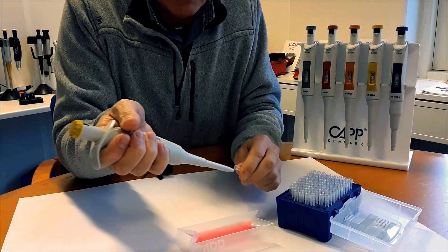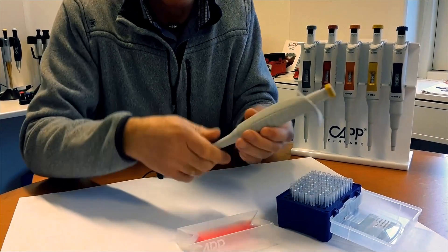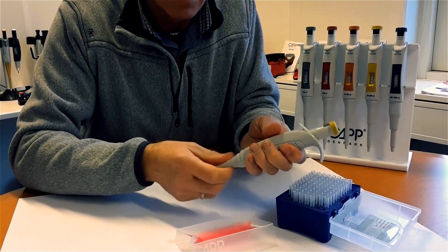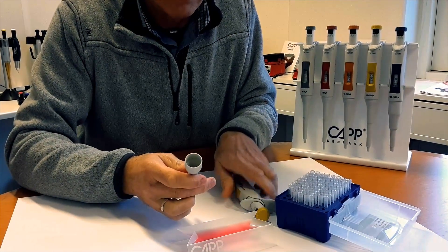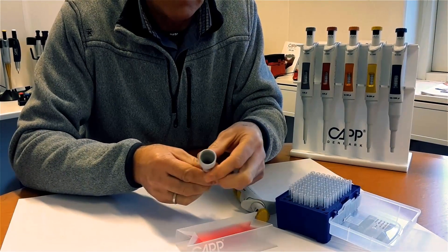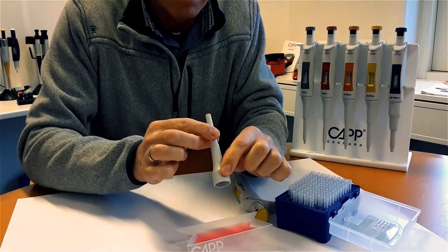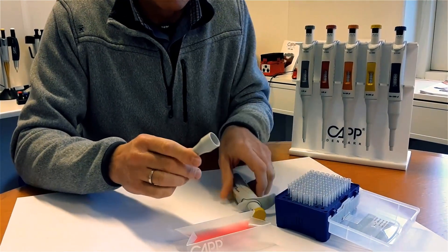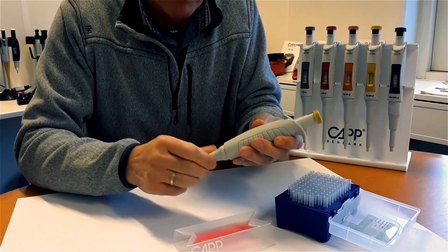In case of any discrepancy, gently unscrew the tip ejector. Visually verify that the tip ejector thread is intact and check for any visual damages or signs of contamination. Screw it gently back onto the pipette and perform the test once again.